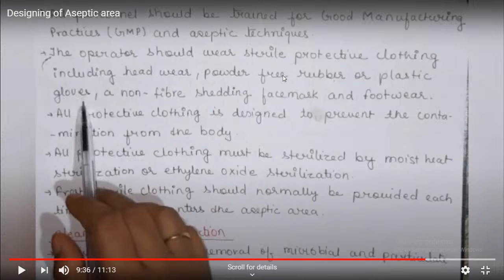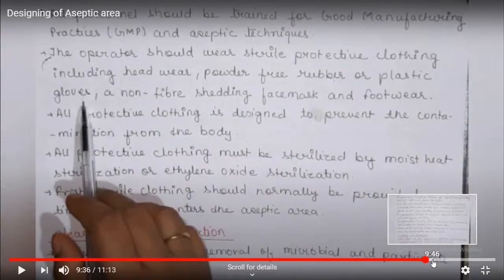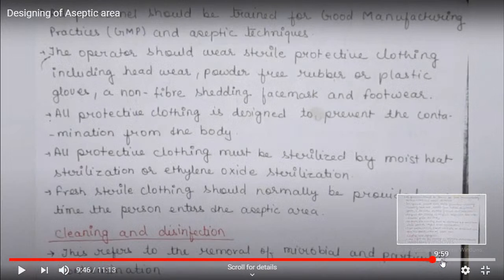The operator should wear sterile protective clothing, powder-free rubber or plastic gloves, and non-shedding fiber clothing. Those working in the aseptic area have knowledge of aseptic technique and wear the clothing to avoid contamination. This clothing is sterilized by various disinfectants, moist heat, or using ethylene oxide.